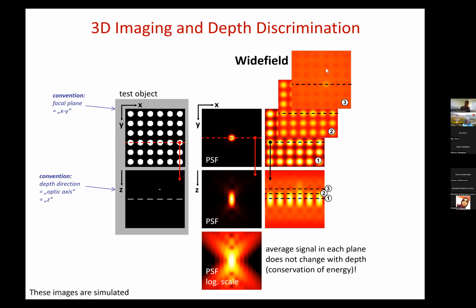So the wide field microscope really is terrible in excluding out of focus light from objects out of focus. And in this case particularly, right, we have this tiny little object here. It's barely visible here in front of that background of all the other disks here. So we'll look in a few minutes at the same simulation with a confocal microscope again. I'll show you the comparison there. But first, let me explain now what the confocal microscope is and how it solves that problem.